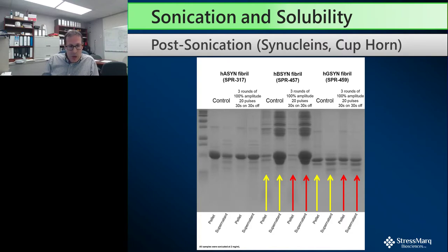What you really need is to hit it with the proverbial sledgehammer and use metal ions and so forth to induce it to fibrilize, which are then, of course, subsequently removed after the fibrils are formed. So they are excellent controls in that regard. But it does seem that they are already in solution and hence don't really benefit from the sonication process because they don't need it. Now, on the final side with gamma synuclein, we see very little effect at all, the sonication process doesn't really seem to do much of anything.